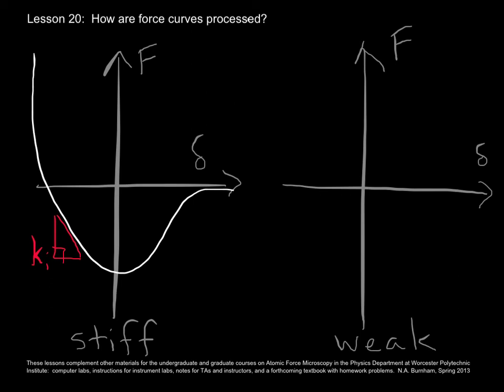Well, remember there's a long straight line in it when the cantilever is in contact with the sample. What that becomes is just a vertical line along the y-axis, and the jumps look like this. This one for the approach, this one for the retraction, with the evident hysteresis there.